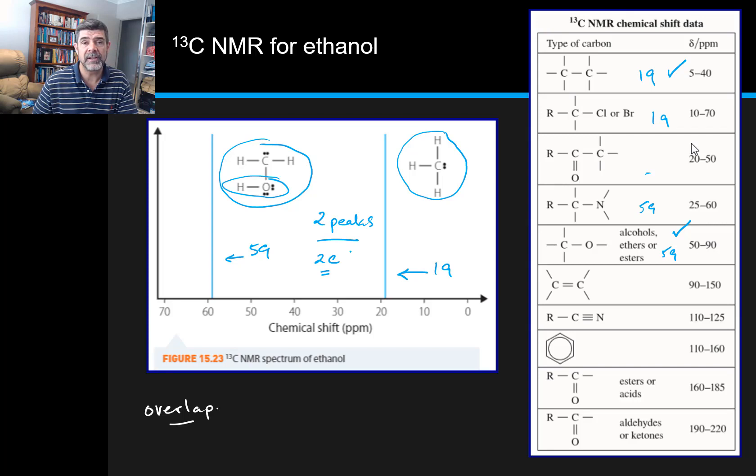One extra piece of information that we can use to help us identify what's going on here is to also look at the proton NMR or the hydrogen-1 NMR for ethanol. So here is the proton NMR for ethanol.